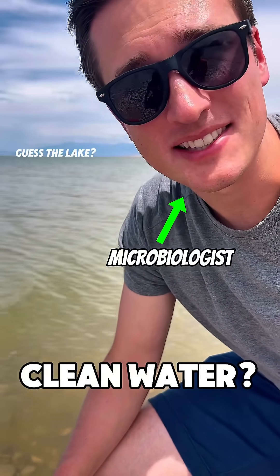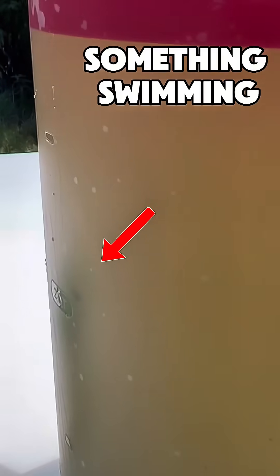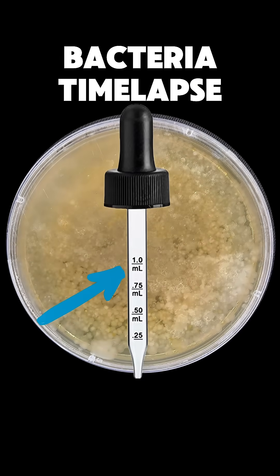I'm going to get some water from the dirtiest lake in my state. Alright, so I'm back in my lab and let me show you what's growing in that water. There's over 50,000 bacteria in every milliliter.